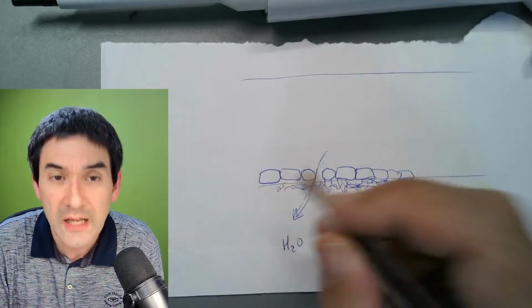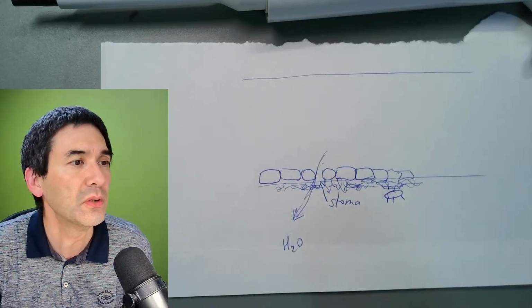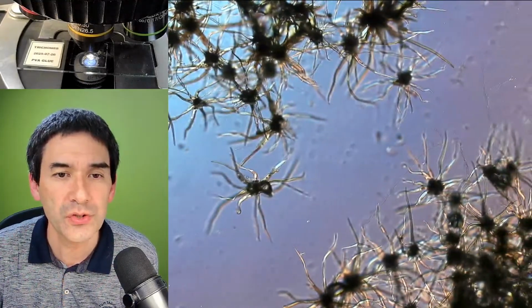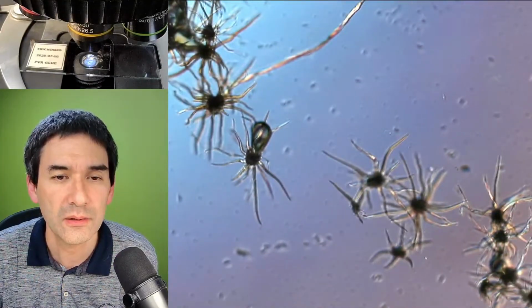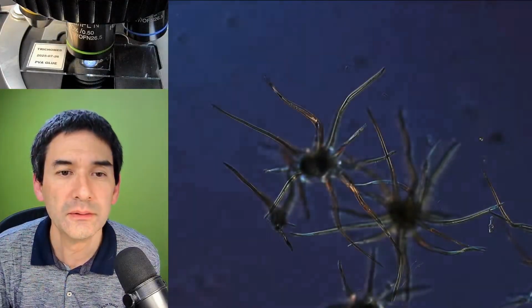And those trichomes, they're growing here, and they can have different shapes and forms. What I kind of like about those is that they do look quite nice. Where are they? Just a second. It takes some time again for the camera to switch on. Here we are, right? So let's go up with the magnification. Let's pick out one of those here. I don't know. Here they're clustered together. I mean, maybe over here. Okay, and yeah, let's go up.